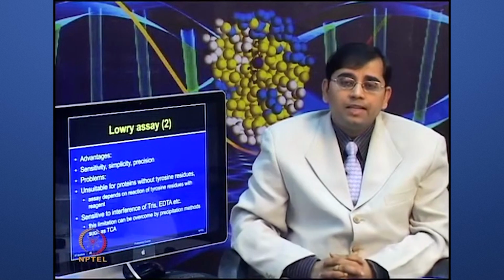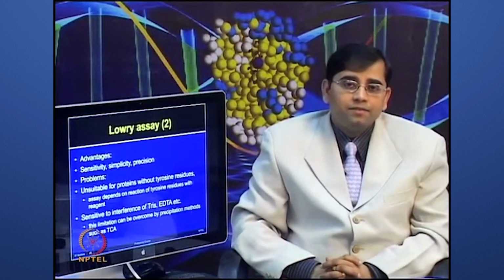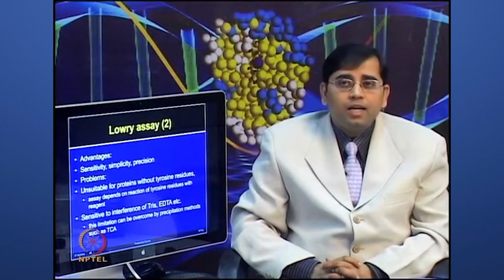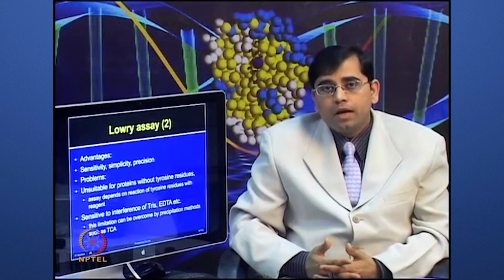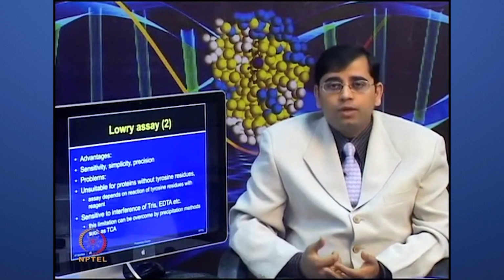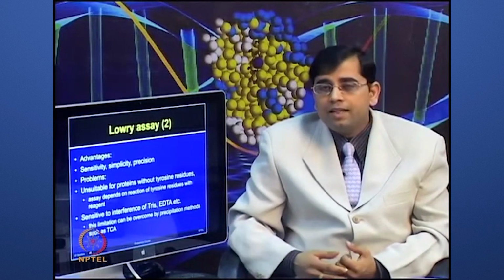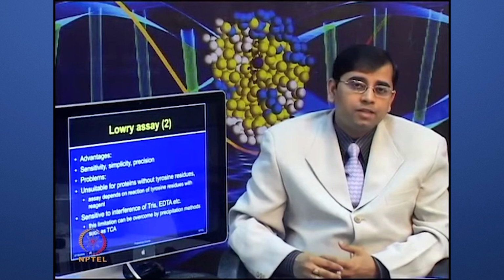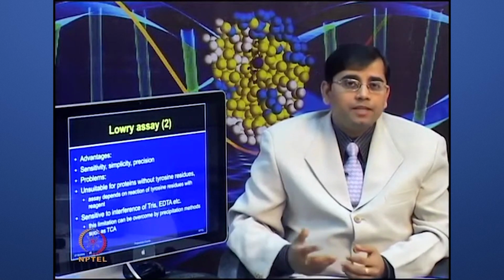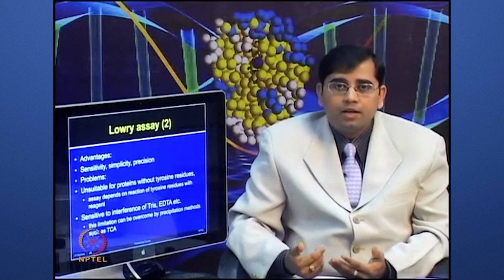This method is very simple, it is very precise and it is very sensitive. These are various advantages of using the Lowry assay, and that is why when people have abundant enough proteins in their samples, they have conventionally used the Lowry method. But if you are using clinical samples or samples with very low yield, this may not be the best method to use, and that is why there are other methods available.